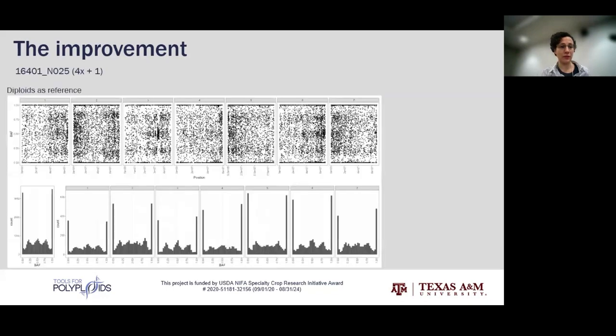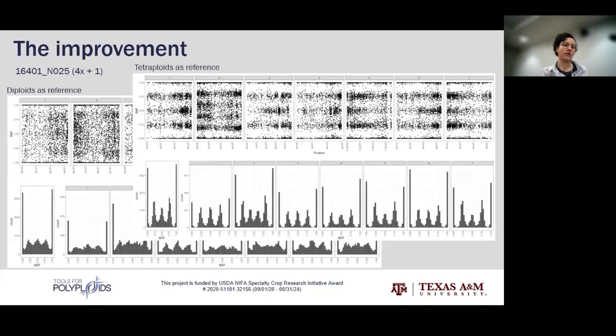And because it became clear to see, we start to detect some weird patterns. Like, oh, this one here, it has 4 heterozygous, and between the others that have 3. So it's a 5-copy chromosome. So we start to detect aneuploids.